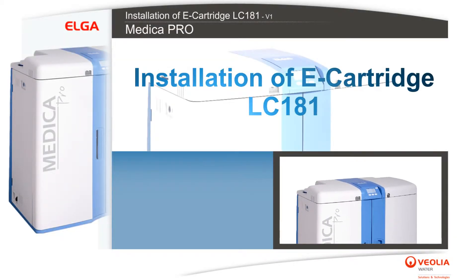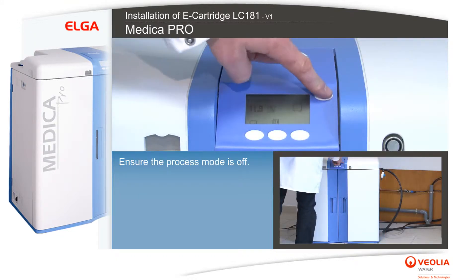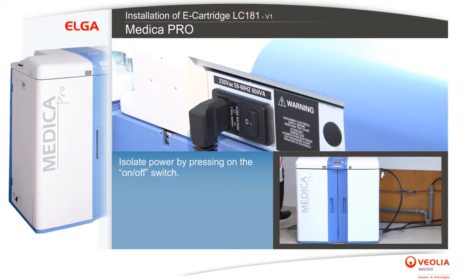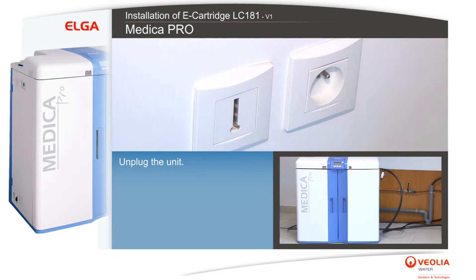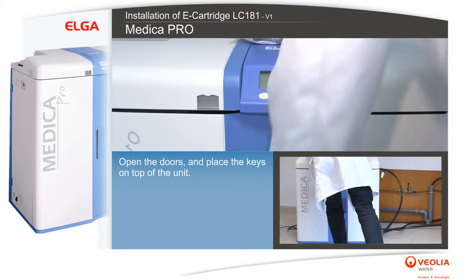Installation of the e-cartridge LC 181. Ensure the process mode is off. Isolate power by pressing the on/off switch. Isolate the feed water valve, unplug the unit, open the doors, and place the keys on top of the unit.